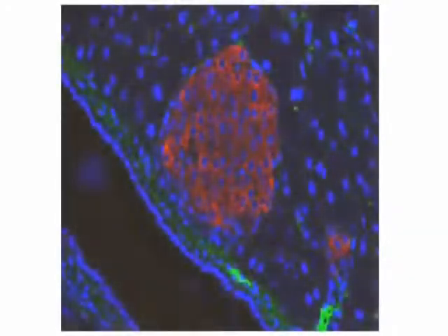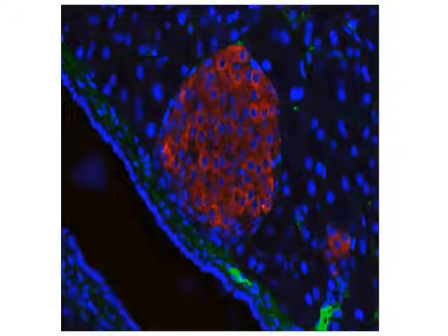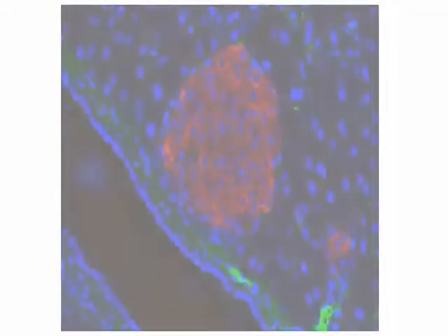Different fluorochromes which are connected to different monoclonal antibodies can be used at the same time to visualize two or more parts of the cell. So as we can see in this photograph, many parts of the cell are stained at the same time.